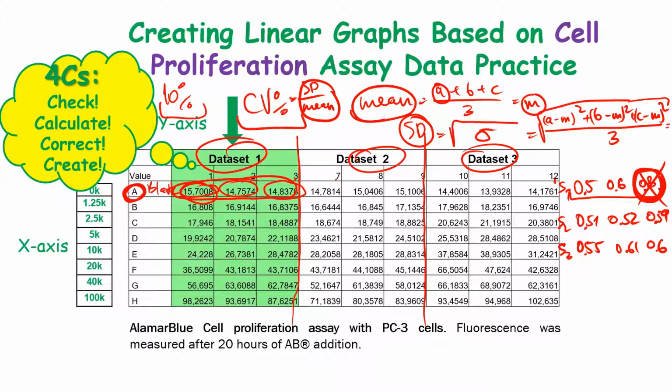Why would you want to do that? Just to make sure that your experiment is precise. If you have a high value of this coefficient of variance, it means that there might be some problem with an outlier.